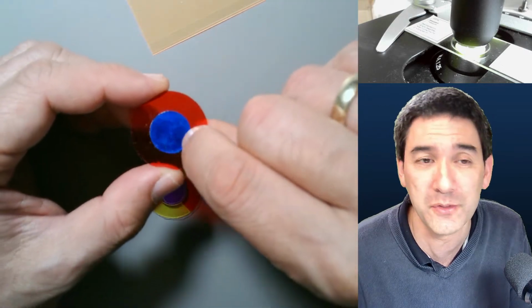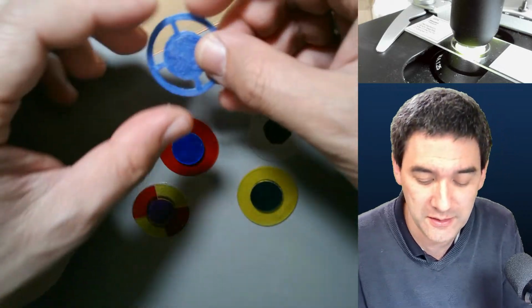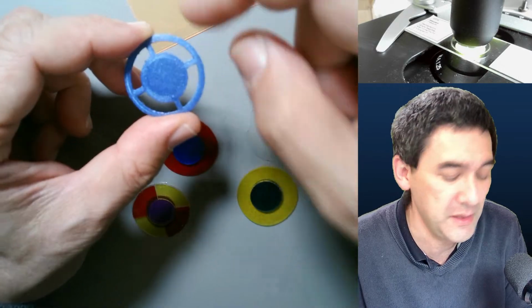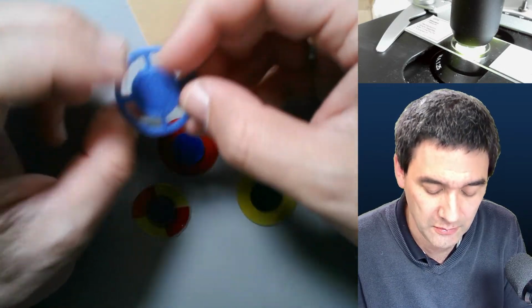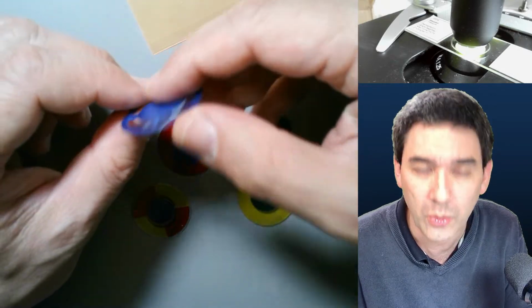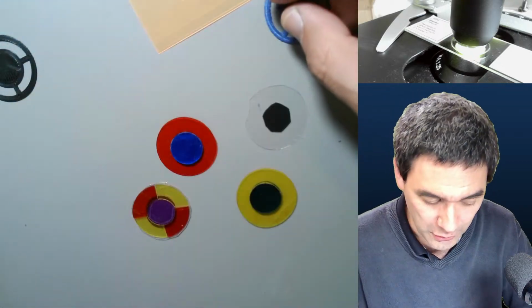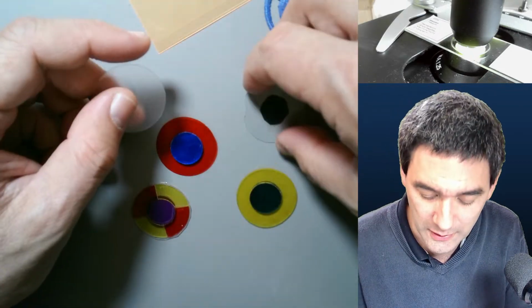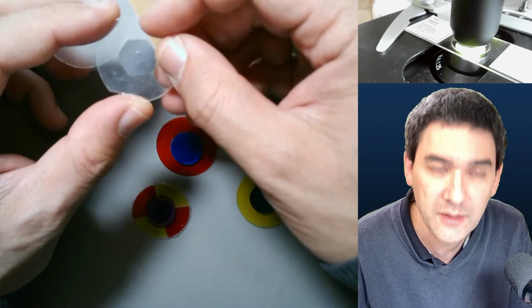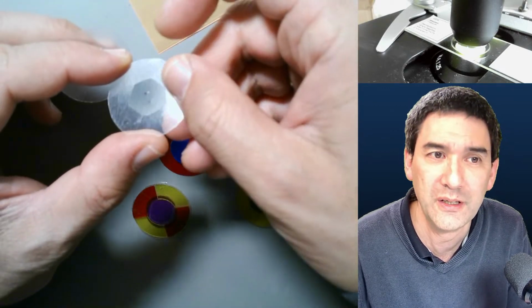Yeah. Or what you can try to do as well, I've also done this in the past. Look, this is a 3D printed one. Okay, this is basically a blue background with a non-colored periphery over here. Or you can try to use nail polish of different colors and put it on a plastic disc as well. And if you just want to very quickly experiment with dark field, you can also cut out some electrical tape, like this one that I cut out and glued on here. That also works.